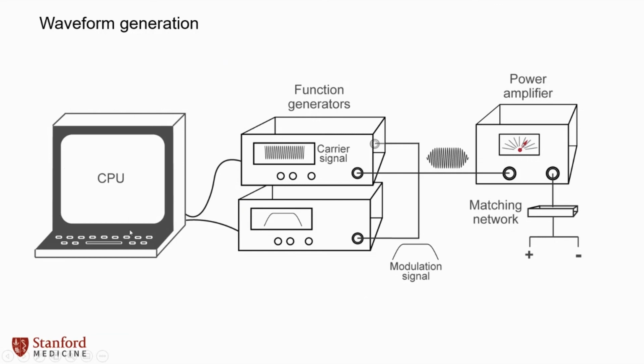You can have a laptop and 2 function generators, which I'll show you some examples of. In many cases, you may want 2 because you can basically modulate a continuous frequency. Let's say I have 500 kilohertz here with an envelope frequency. You would multiply these 2 together and you'd get this smooth waveform. I know I didn't get into this today, and it's a little bit out of the scope of the talk, but smoothing the edge of these waveforms basically stops the animal from hearing these continuous wave pulses. So we think. And you're feeding this envelope into an amplifier.